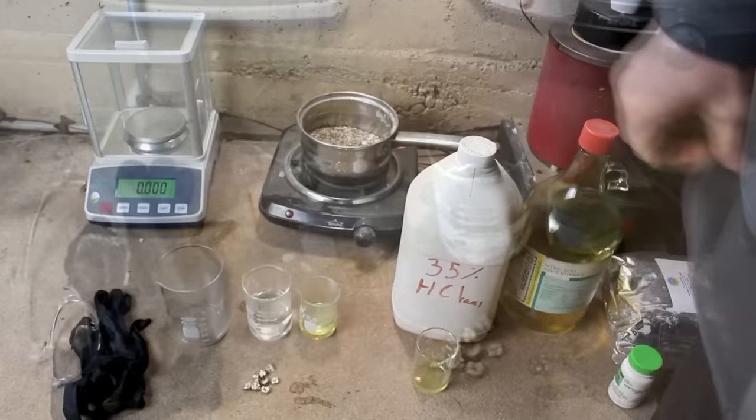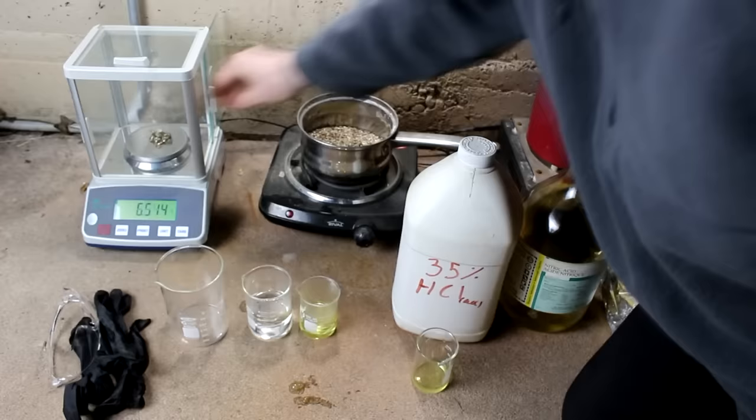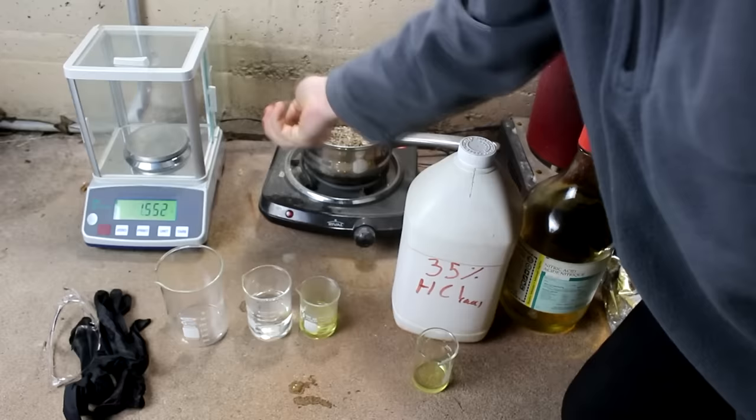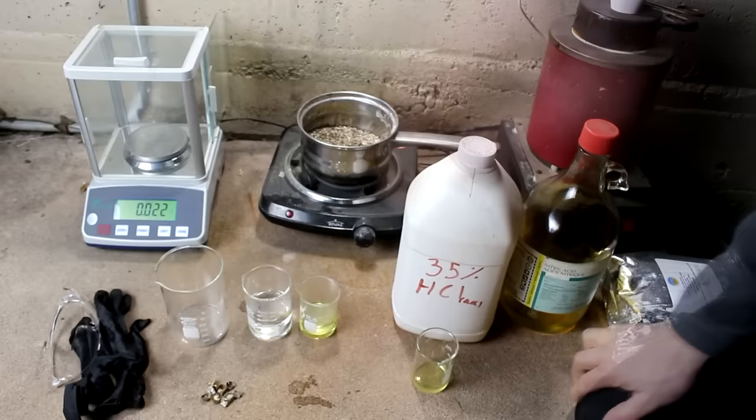Over here I have a scale to weigh the materials — to see what we have to begin with and what we have after, so we can determine if we lost something along the way. Measuring out those teeth, it looks like just under 25 grams total. Now considering that's 18 carats, that means I've probably got about 18 grams of gold, which is quite a significant amount — actually more than I've ever done at one time.